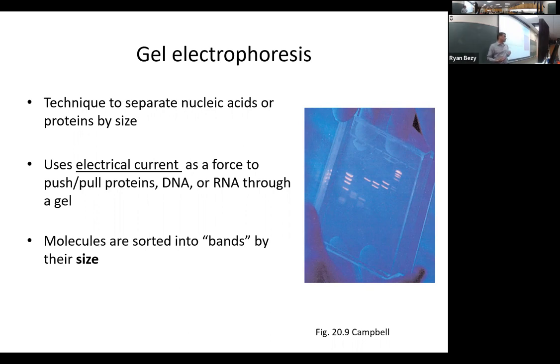or the protein molecule. And what it does is it uses a gel, and this is a little bit of a gel right here, but I also have some gels that you guys are going to work with in a second. It uses a gel. This is why it's called gel electrophoresis. And it literally is basically kind of like a slightly thicker gel. It's that type of consistency, a little thicker, less wiggly though. But it's a technique, it uses this gel, you load your, say, DNA onto wells in the gel. I'm going to turn the lights down because it's kind of hard to see otherwise.